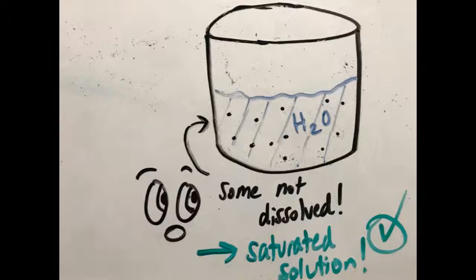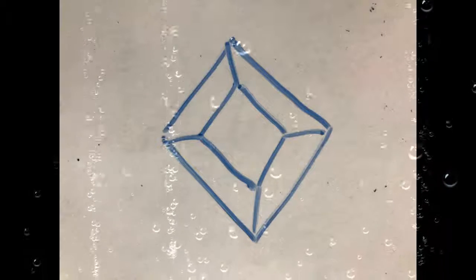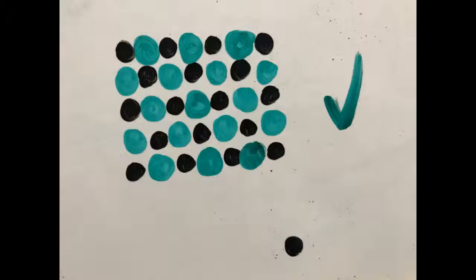You should also ensure that there is an optimal amount of solution in the vial. When there's too little solution, the dry environment is not optimal for the particles to swap. If there's plenty of solution, the process will be slower, but as long as the solution is saturated and you are willing to wait it out, this can produce a high-quality crystal where the appropriate particles have plenty of time to swap into place in the crystal structure.